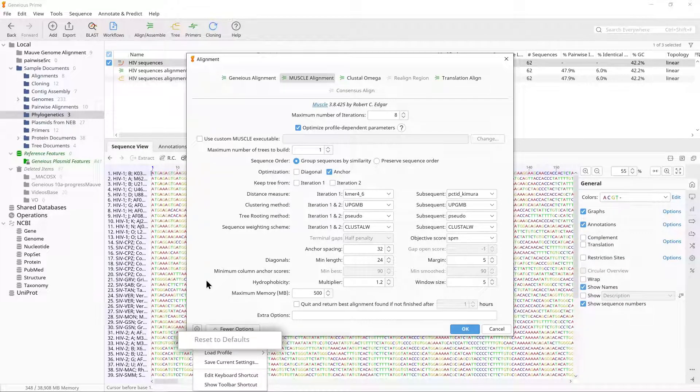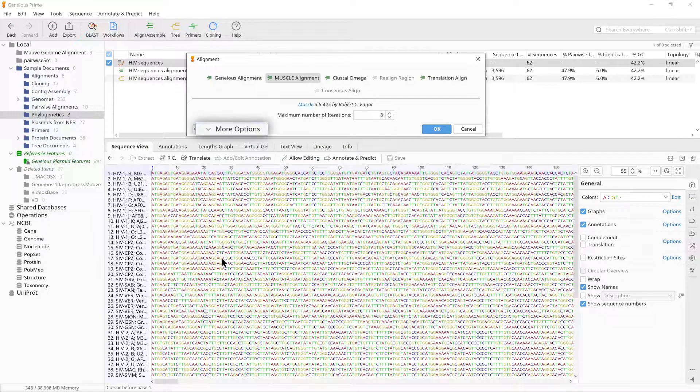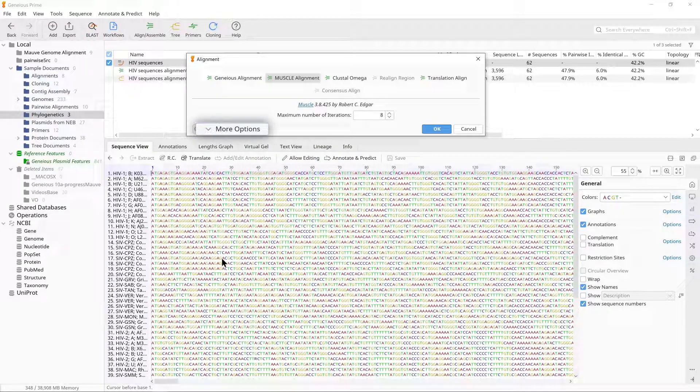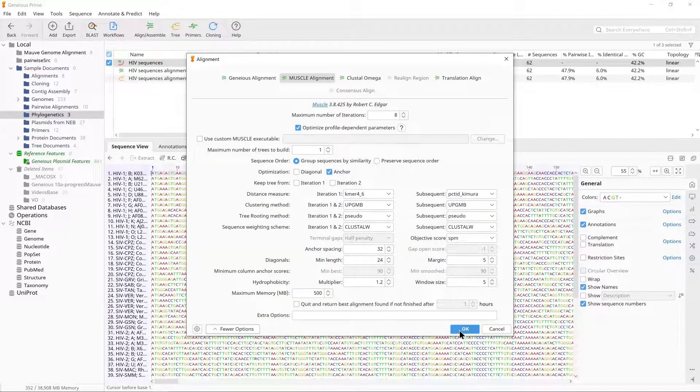If it is greyed out, then the default parameters are already set. Click the More Options button to view the parameters if you wish. Click OK to start the alignment.